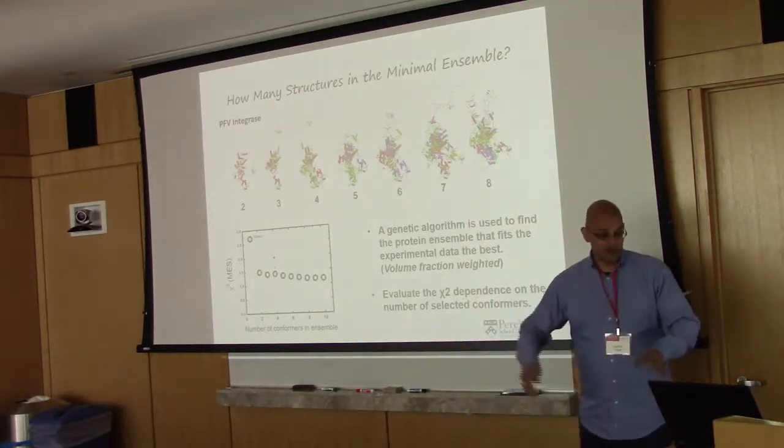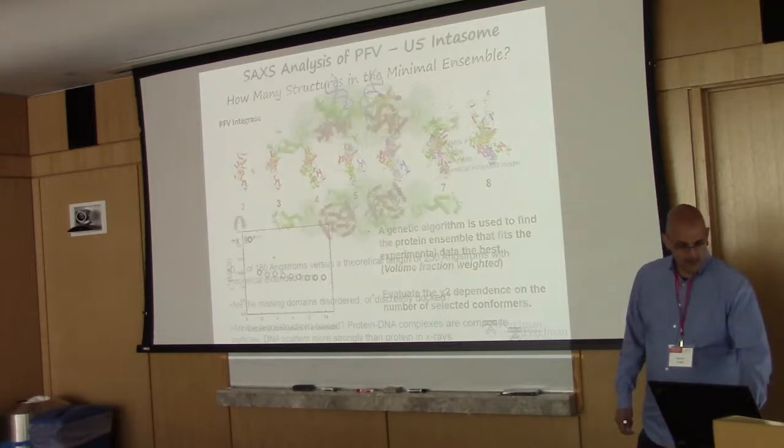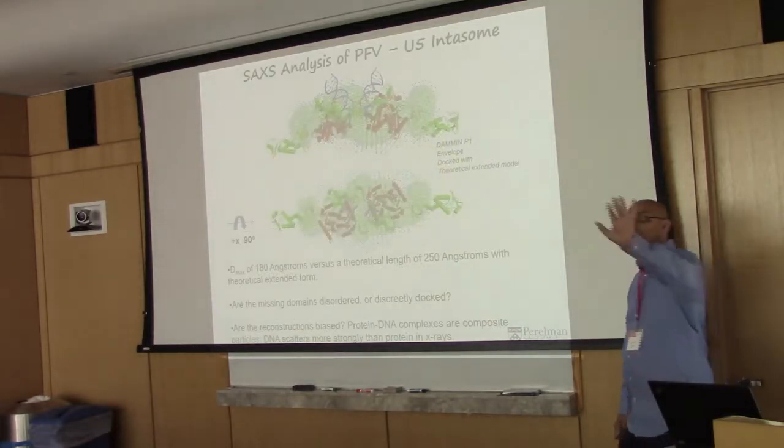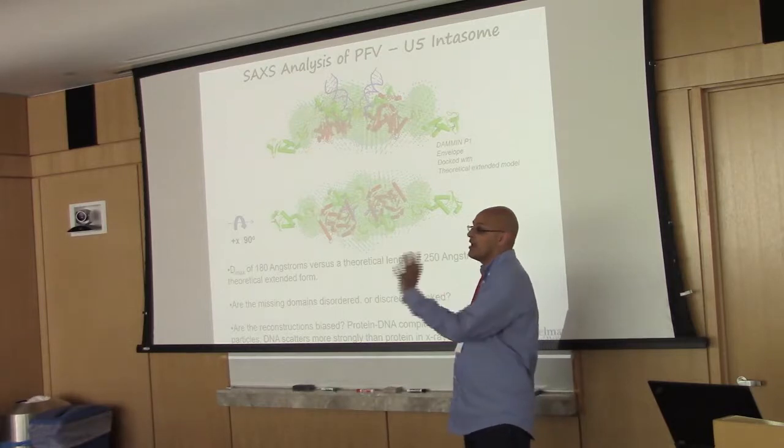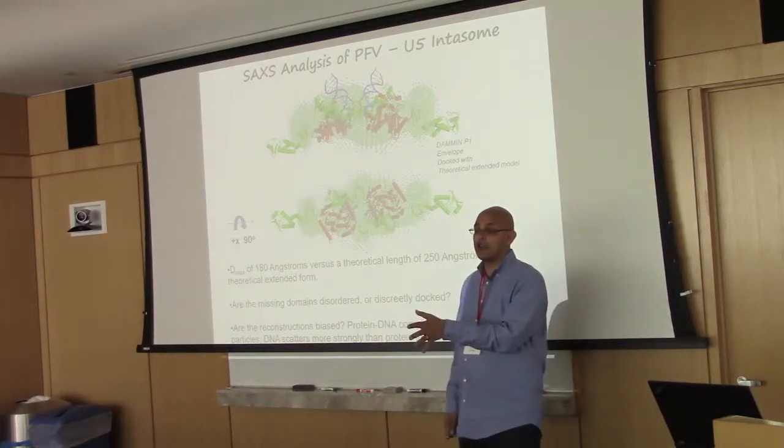And please pipe in with questions. I know I'm kind of going through this rather quickly. All right, so that's the protein monomer. That's about it for all the talk about the atomistic modeling. Everything from here on out, I'm going to talk about is contrast variation.